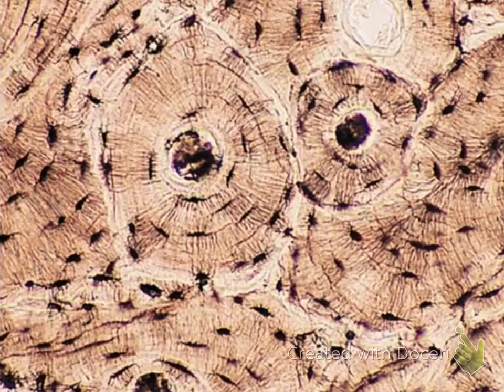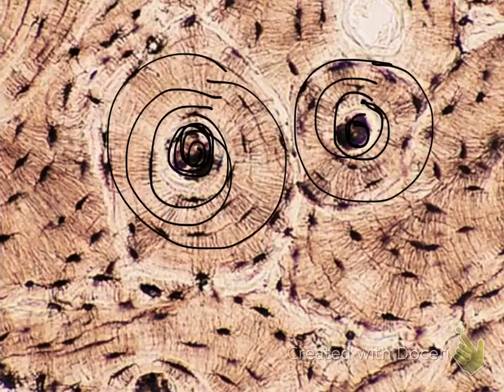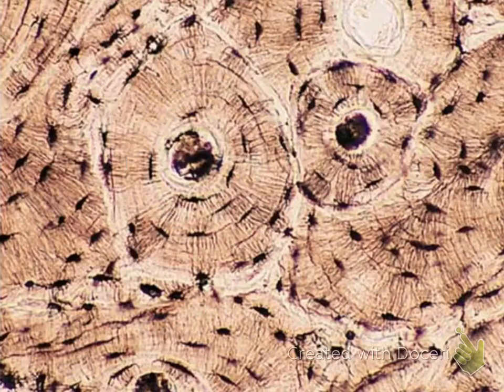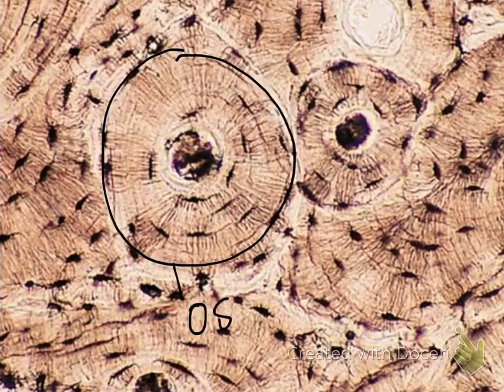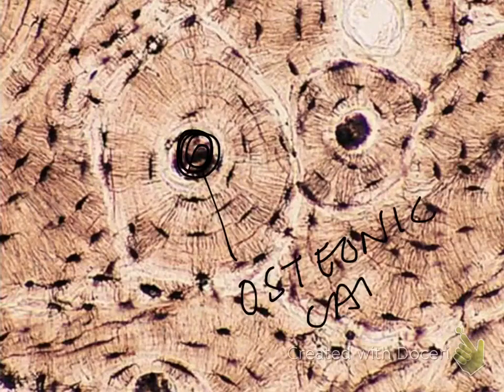The first thing you notice about this tissue is the dark center in the middle with concentric circles around each one. Whenever you see those concentric circles, you are looking at bone tissue. One of those big round circles is called an osteon or Haversian system. The center portion of that osteon is called the osteonic canal or central canal.